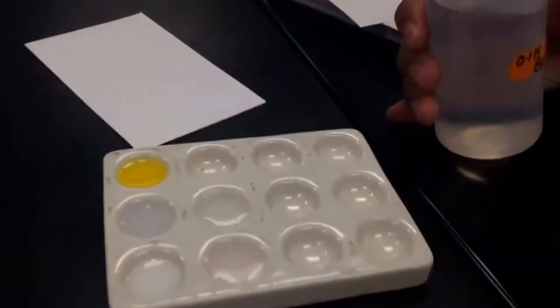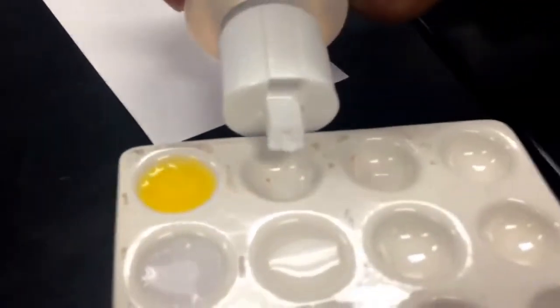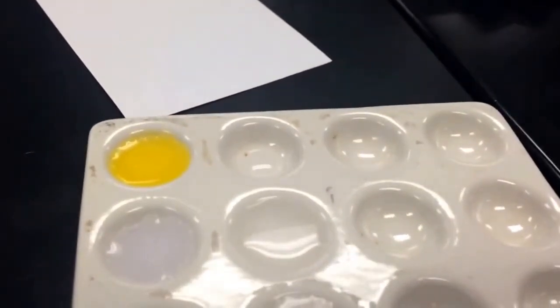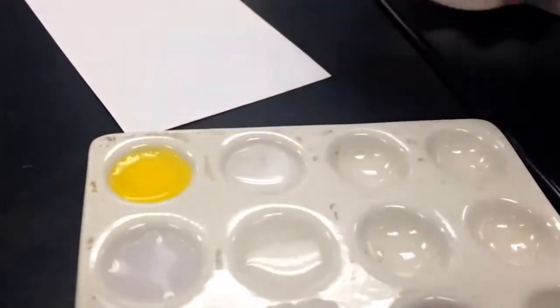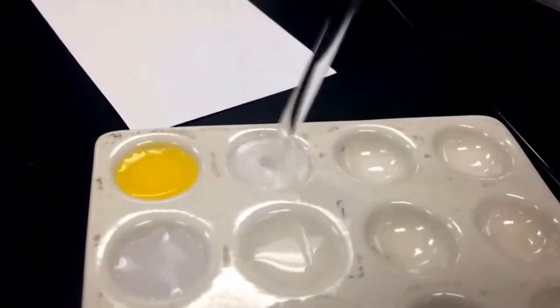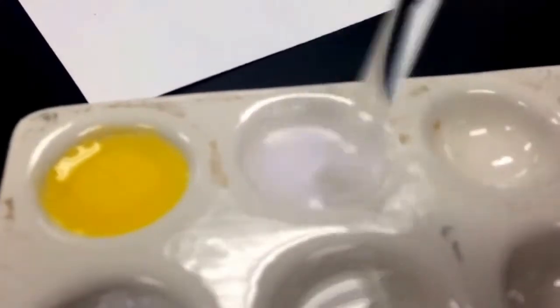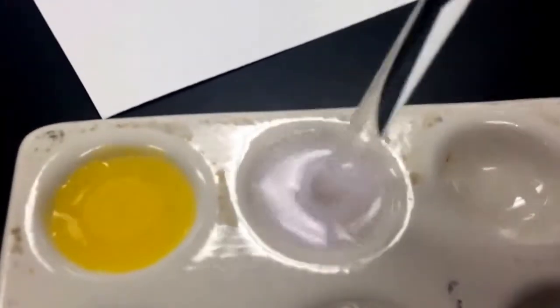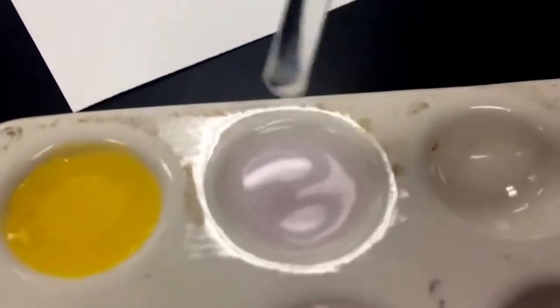Number 6 is barium chloride with sodium carbonate. So here goes the barium chloride. Let's make sure this one's clean. Always make sure your lab equipment is clean, guys. You don't want the previous incident to occur. Alright, and here's the second chemical, the sodium carbonate. And you see the precipitate. Small, even smaller than the third mixture, but it is there, very present.